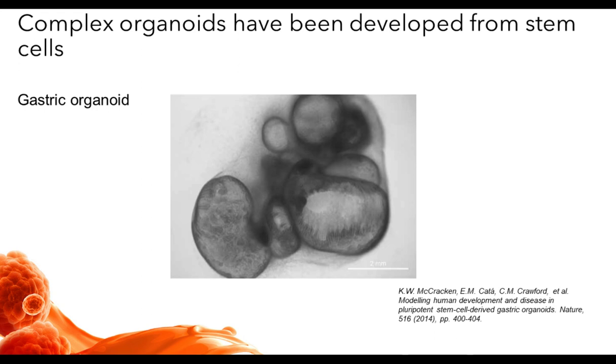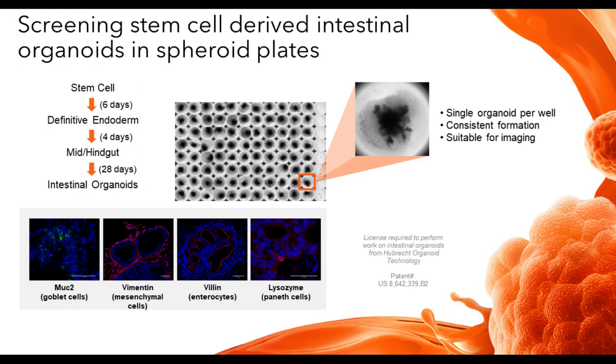The spheroids were then directed using various growth factors to form tissues that had gastric glands, pit-like glandular domains, and from this system, the researchers could identify novel signaling domains. In other words, looking at the fundamental organization and the biochemistry of the cells. They could also look at infection by things like H. pylori, which is a fundamental cause of human ulceration.